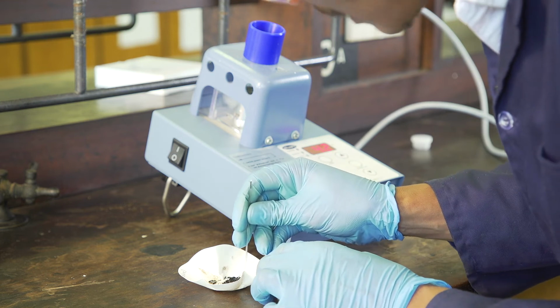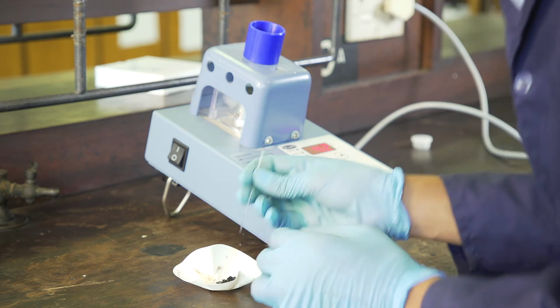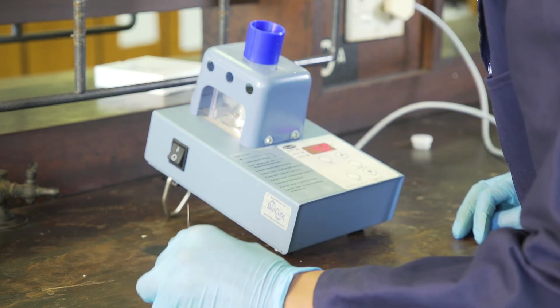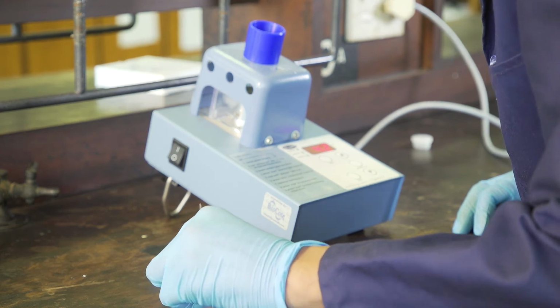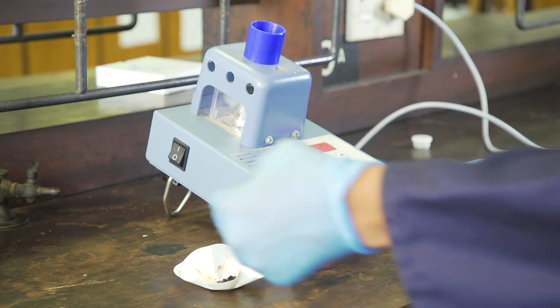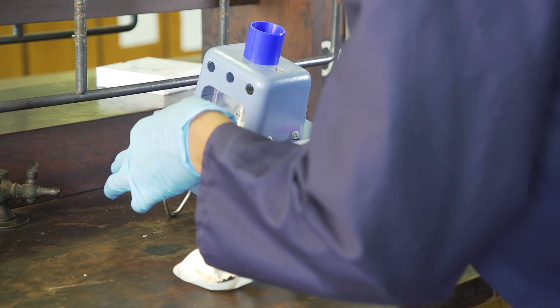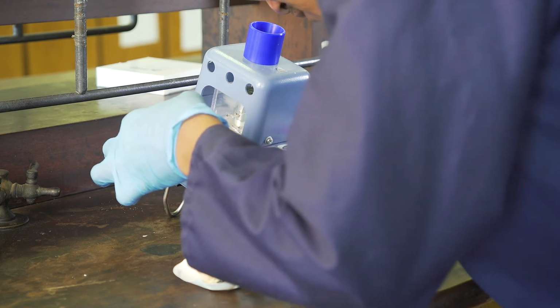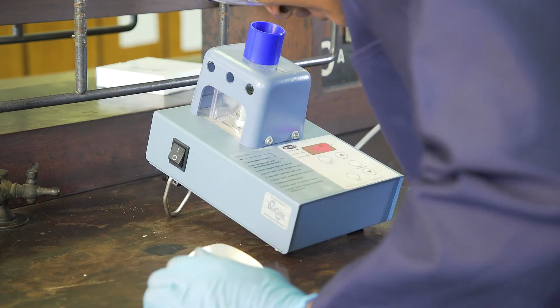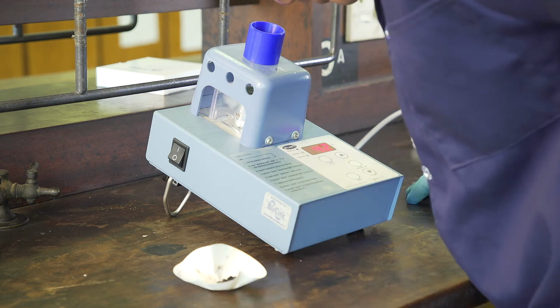To obtain the melting point of our manganese acetylacetone crystals, we will use a capillary tube to insert the powdered crystals into the capillary tube, gently knock down the powdered crystals to the closed end of the capillary tube, then insert the capillary tube into the optical path length of the melting point apparatus, begin heating and observe for the melting point of our crystals.